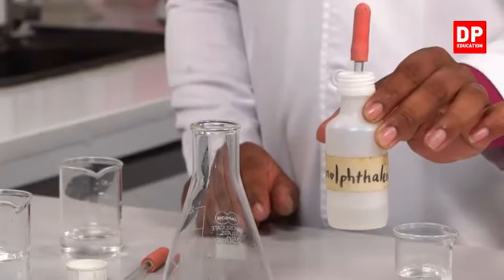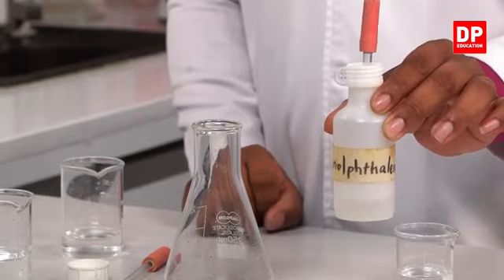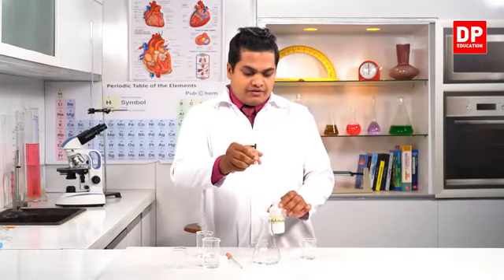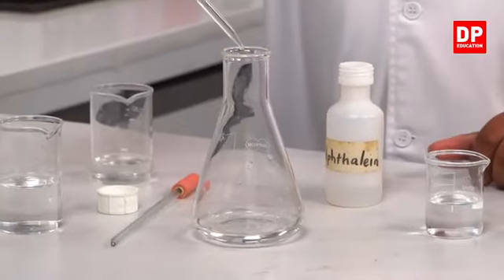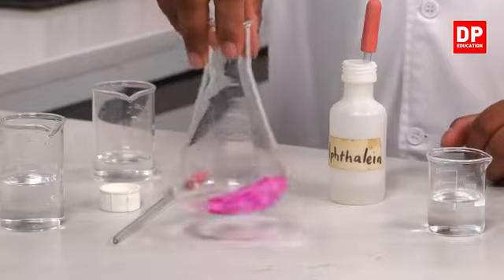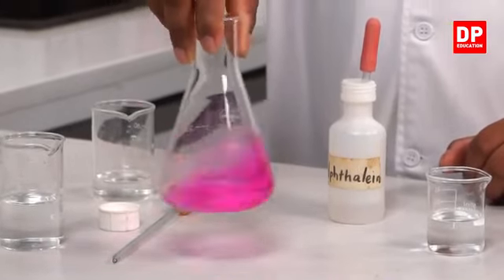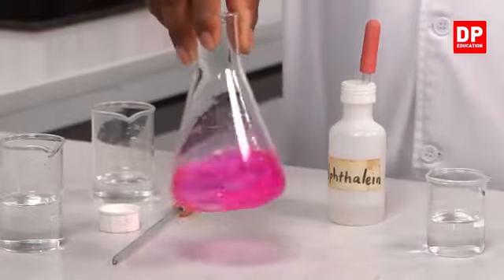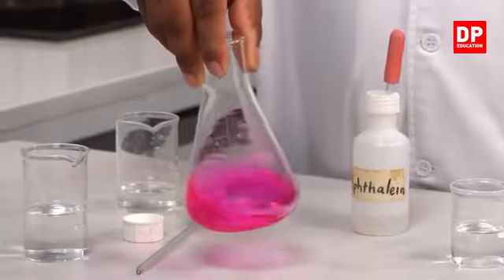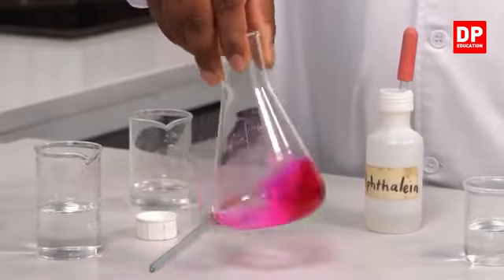Now, before adding the acid, to get an observation, we need to add our phenolphthalein solution. You know that phenolphthalein gives out a pink color in the presence of a base. So we'll add phenolphthalein into this. Have to mix it very well to get a clearer color.